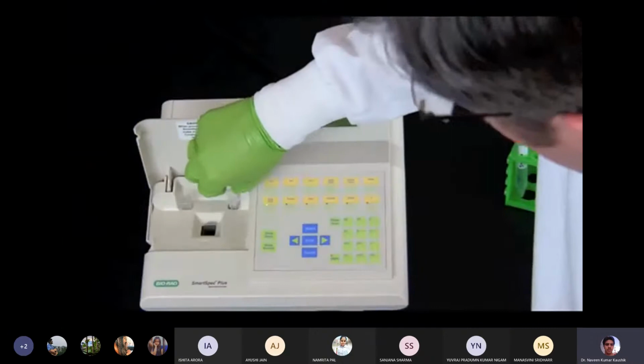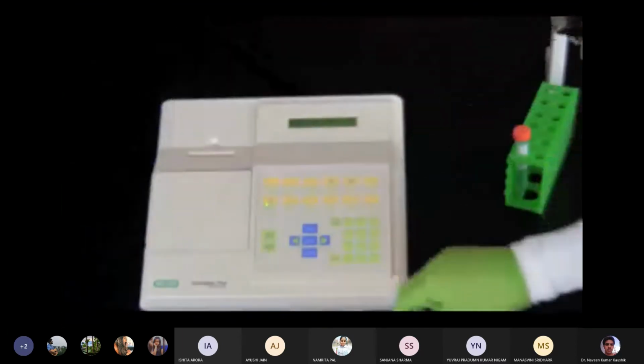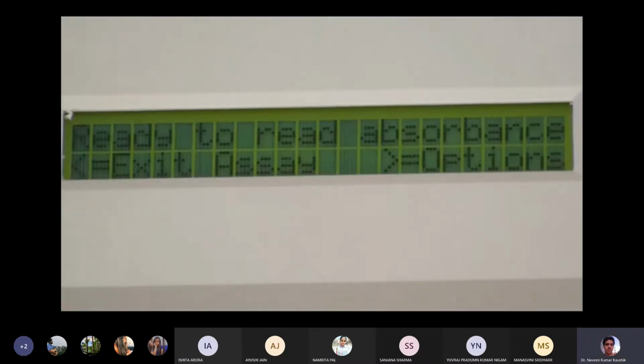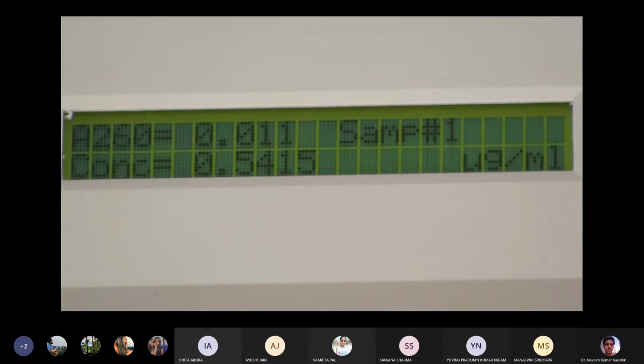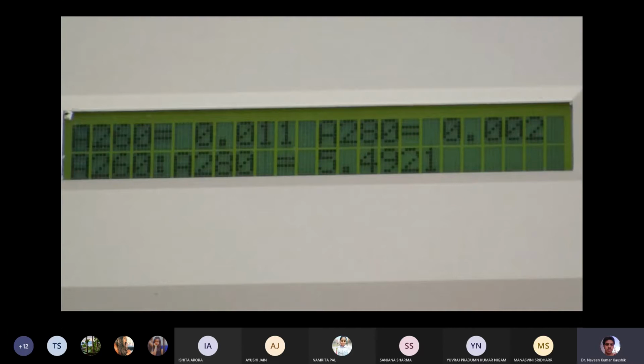Remove the control cuvette and insert the test cuvette with the DNA sample. Press the Read Sample button and then hit the right arrow. When finished, the display will show that the absorbance is 0.011 and the concentration is 0.5415 micrograms per milliliter. The original dilution was 50 to 1, so you will have to multiply it by 50 to get the final concentration. To get the purity, press the 260 to 280 ratio. The result here is 5.4921. Anything greater than 1.8 is pure DNA. Therefore, in this case, we have determined that we have purified plasmid.